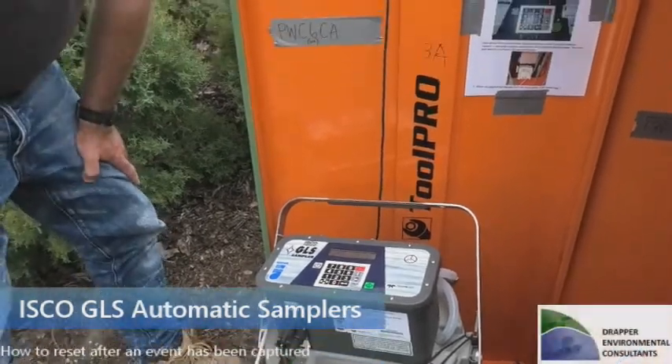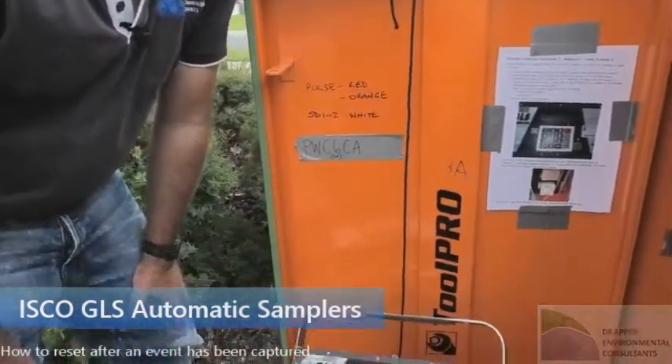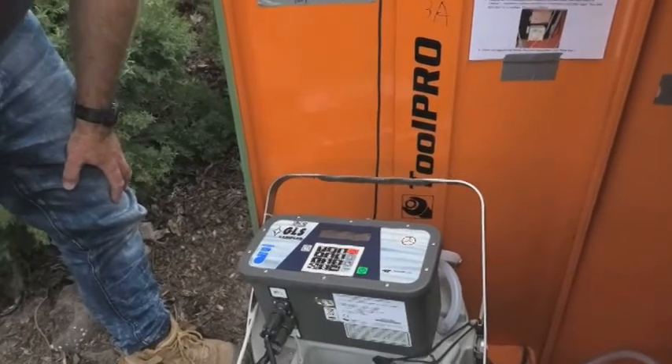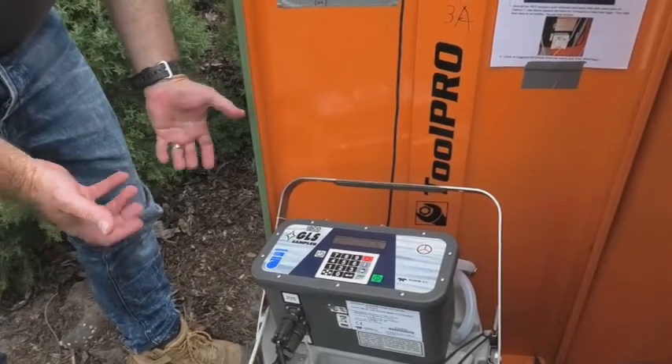My name is Darren Drapper from Drapper Environmental Consultants. I'm just here to give you a quick rundown on how to do a reset process with an ISCO GLS sampler. This one hasn't actually triggered at this stage — we've just set it up ready for an event to come along, but the process will be the same whichever way we go through it.